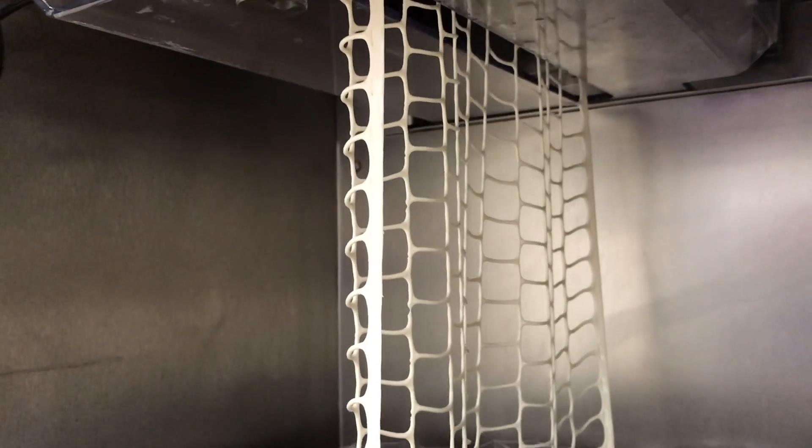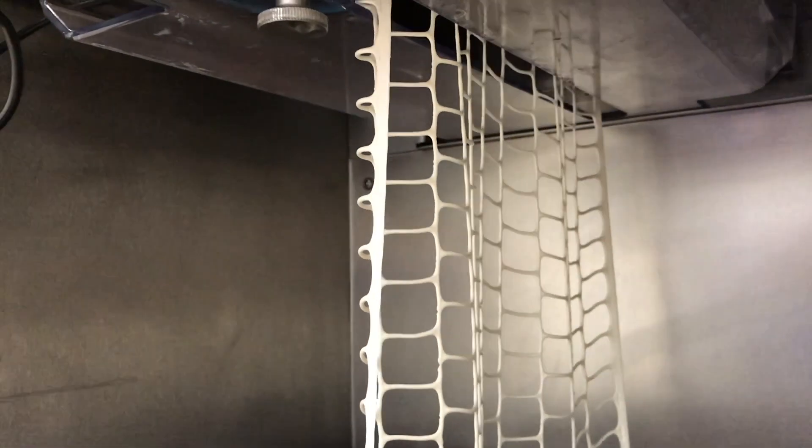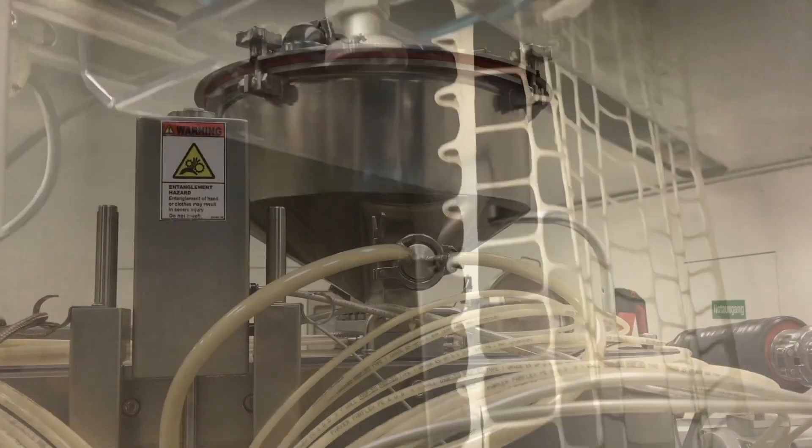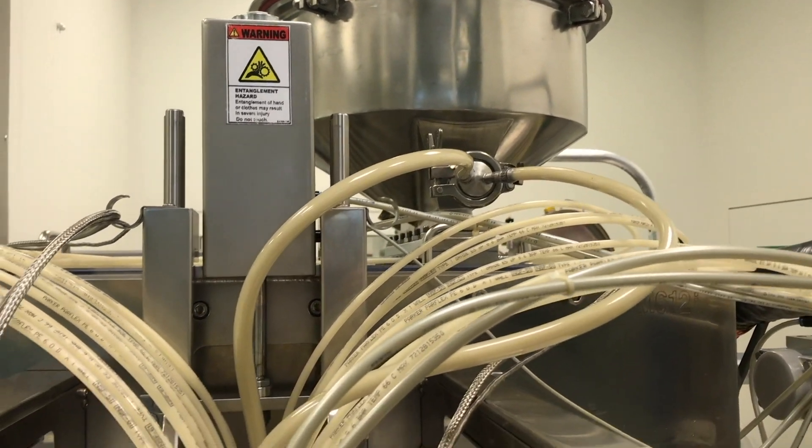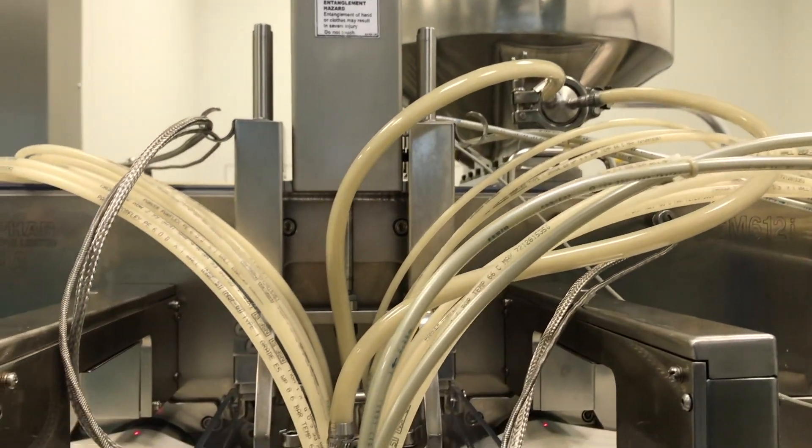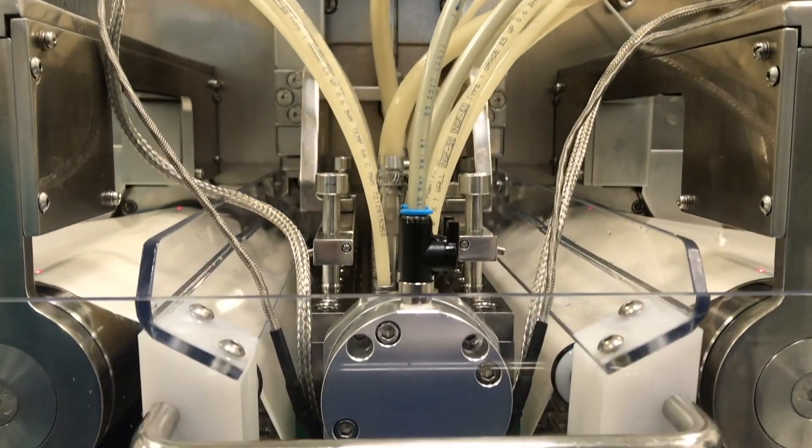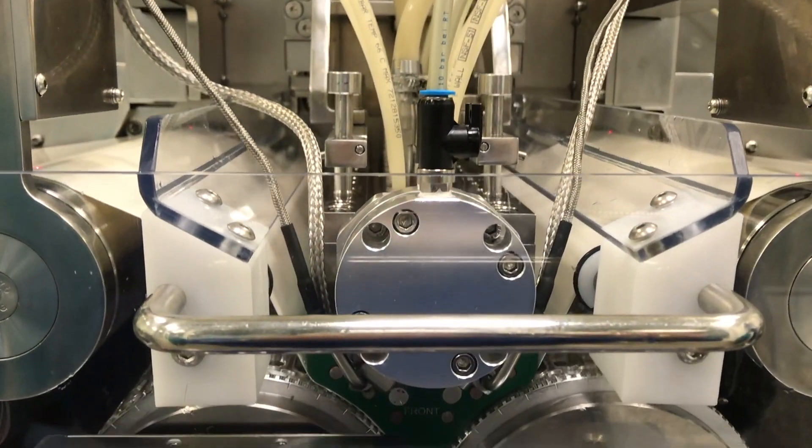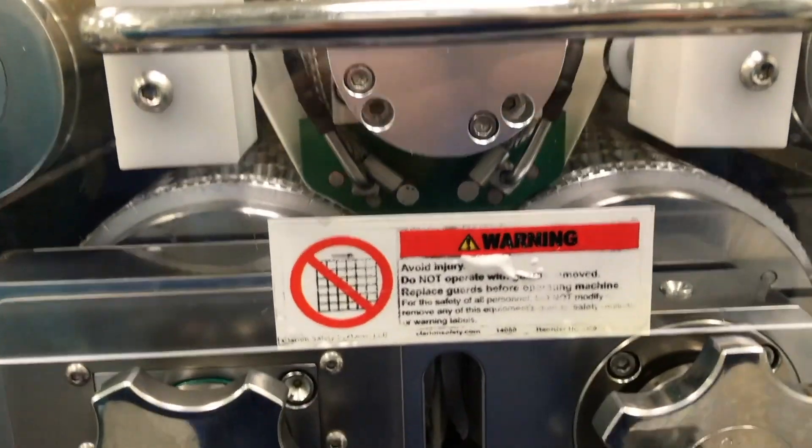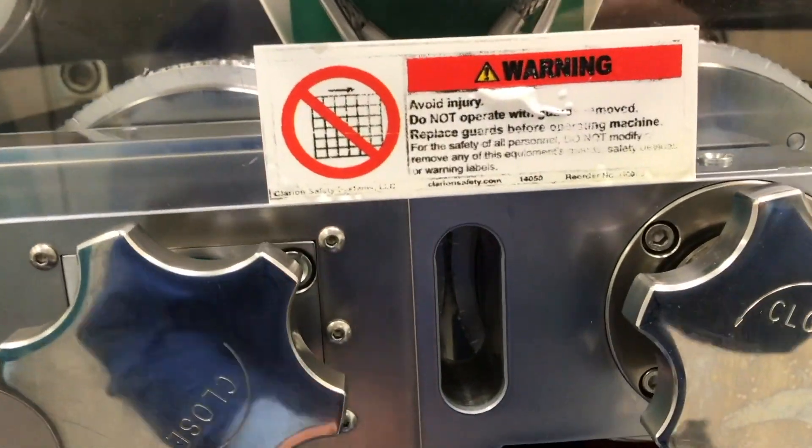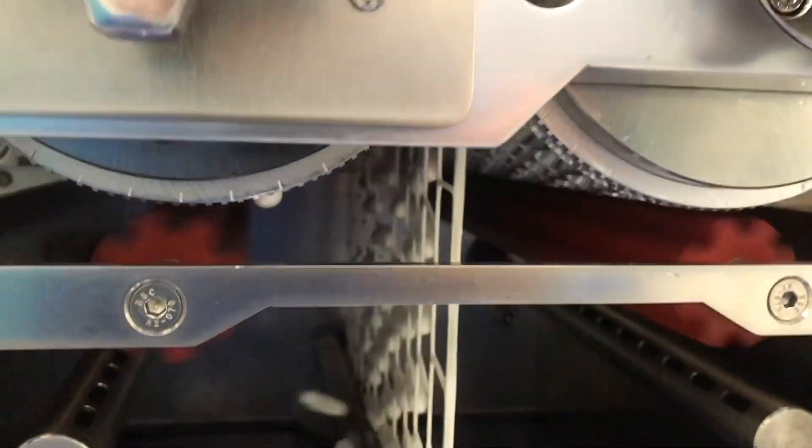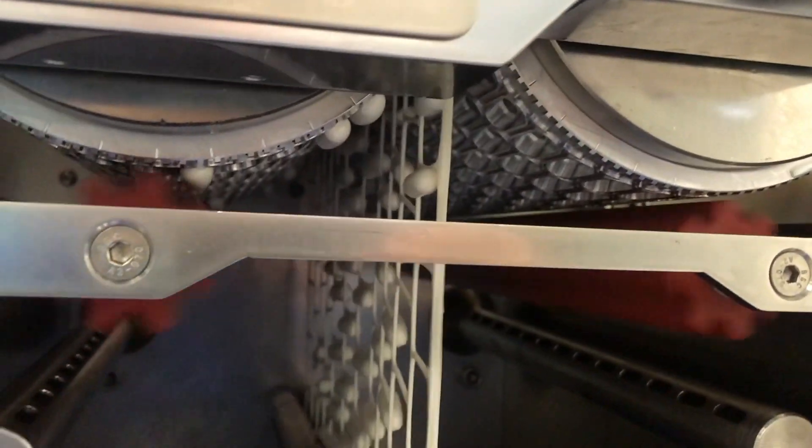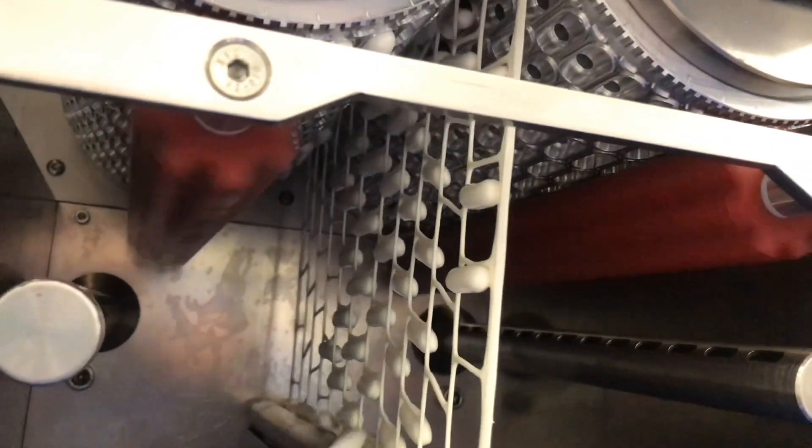Once the capsules are formed, they are then cast out and the cutout that you've just seen is discarded. Here you see the elastic, very wet capsules being separated from their net.